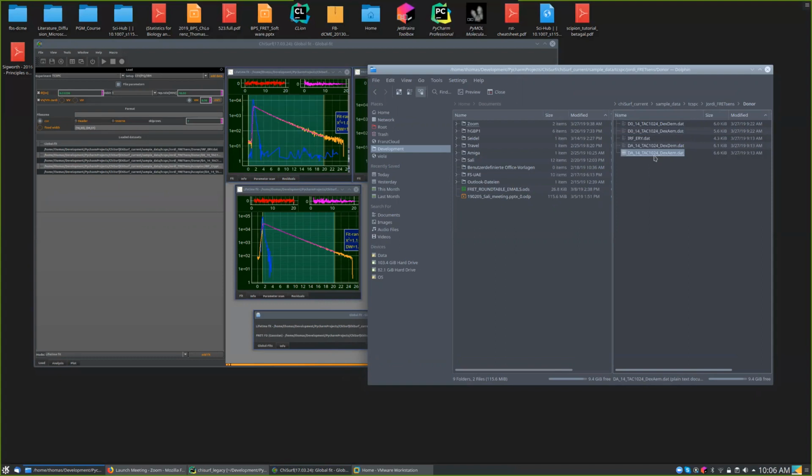And what we moreover need is the response function of the red detectors to the green laser. You know what I mean, Jan-Henrik? No, I'm sorry. So we need another response function. Okay. We need a response function of the red detectors when you excite with the green laser. Okay. Yes, this I can produce. Because we are going to detect with the red detectors, not the green detectors, when we excite with the green laser.